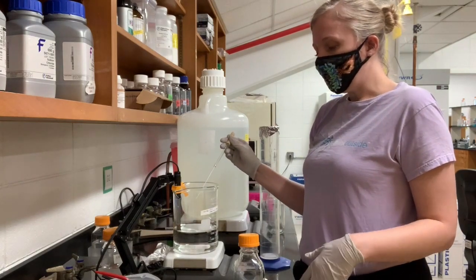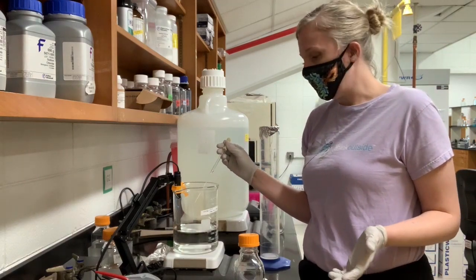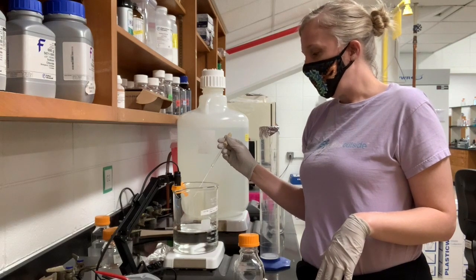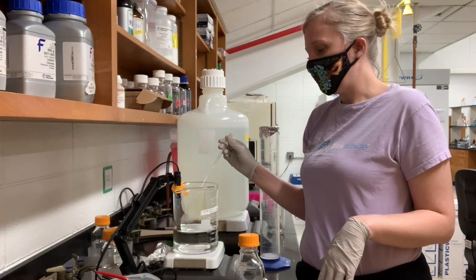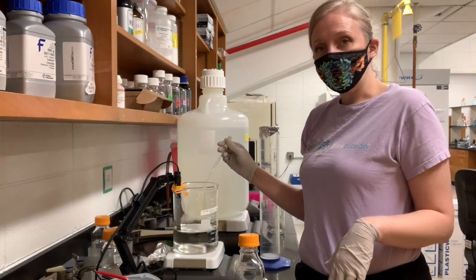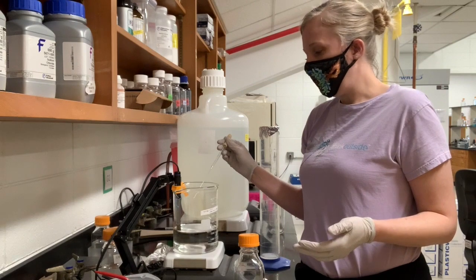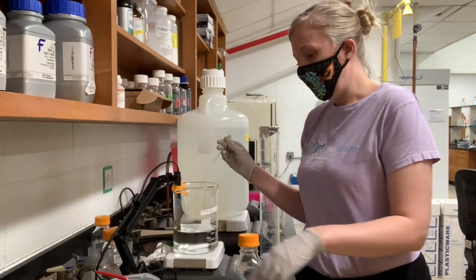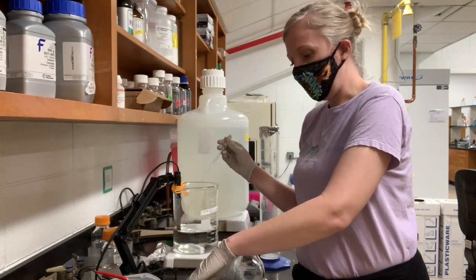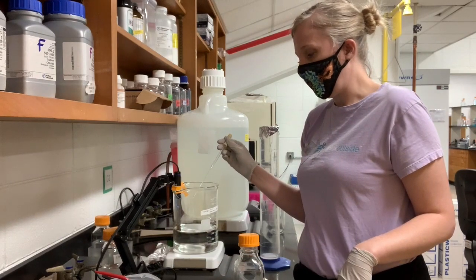If you were to overshoot, so say you were impatient, that's often a problem when we're making solutions. If you were impatient and you overshot and the pH was 7.45, you can often add a little bit of a strong acid to bring the pH back down. For PBS, that wouldn't be the end of the world. You could do that. I will say this, because I slowed down, it changed to ready. It actually stabilized all the way, so I needed to hit measure again before I added the next drop.